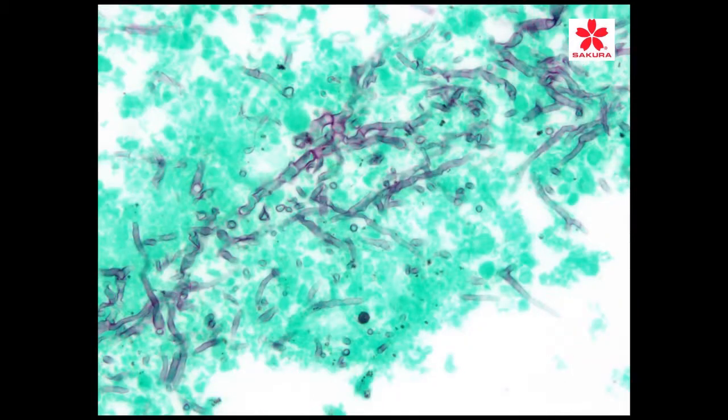As we move on to the next slide, you can see a closer shot. And one of the things about this is that with the silver impregnation, this will continue to develop more and more silver to the point of developing background. So you don't want this to the point that you can't see the translucency between the hyphae. These hyphae are separated by these septa, these separation points here, which this grows into this, and that grows into that. And what you see here is very interesting.